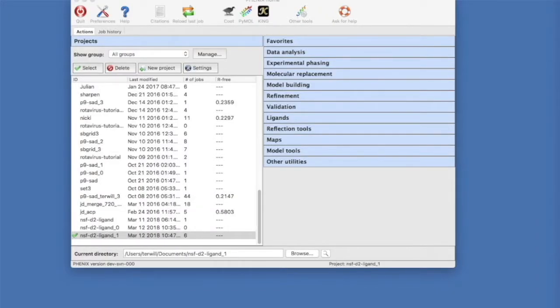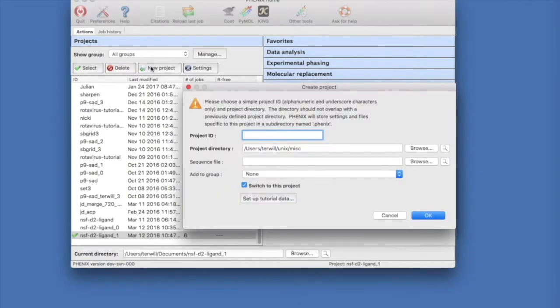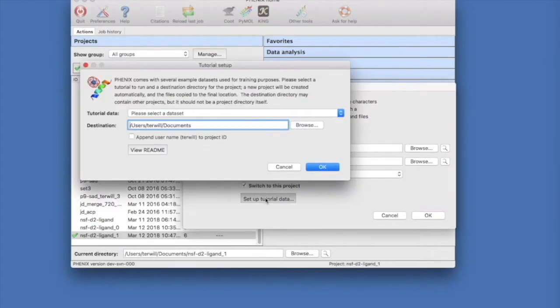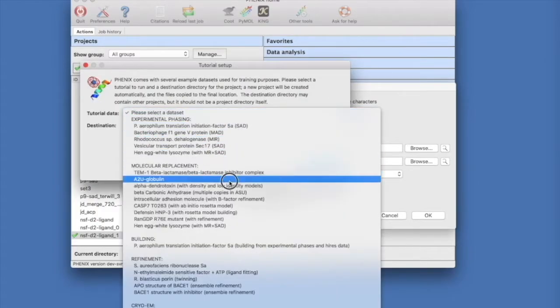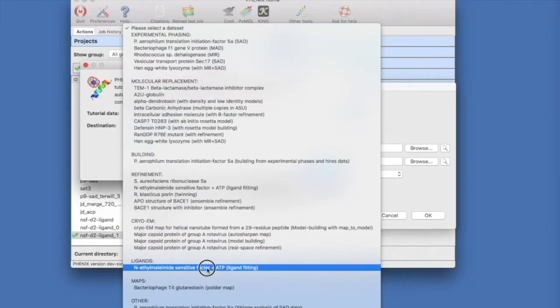Let's go to the Phoenix GUI and set up the ligand fitting tutorial data. Click on New Project and then Set Up Tutorial Data. Then select the Ligand Fitting Tutorial under Ligands.